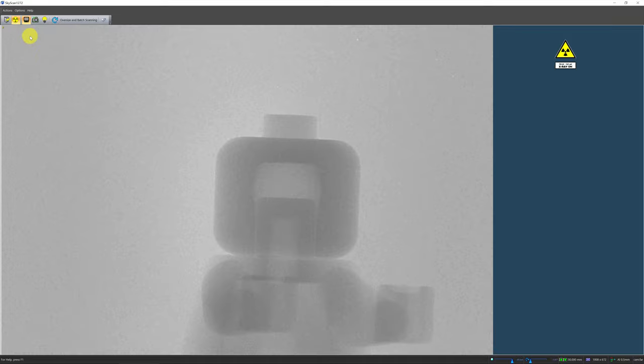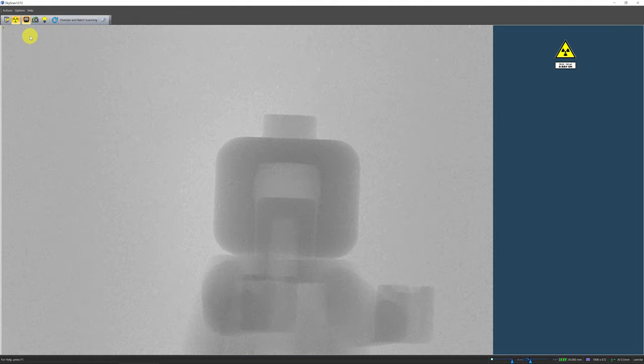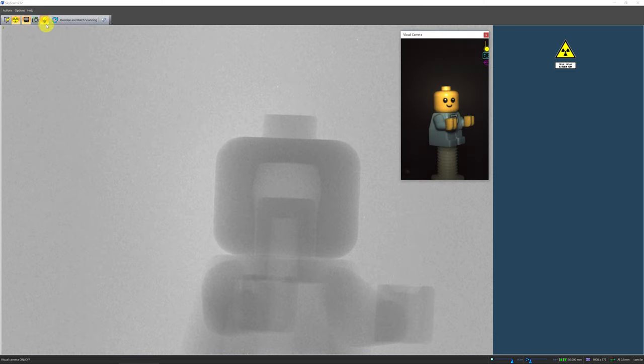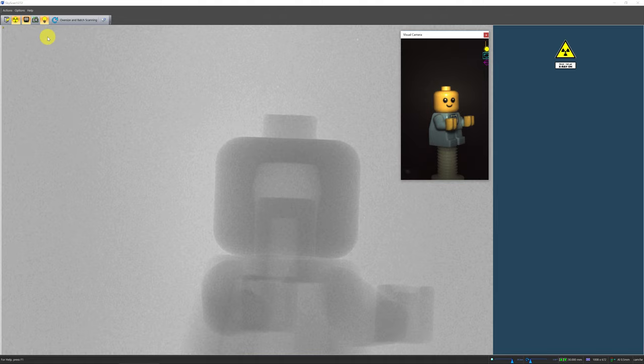First, switch on the x-ray source by a left mouse click on the x-ray icon. After seeing the x-ray sign appear on the screen, click the grab x-ray image continuously icon on the toolbar. The x-ray detector will now start capturing the x-ray transmission signal continuously and display the shadow projection image on the screen. You can also switch on the visual camera by clicking the visual camera icon on the toolbar. This will help you locate your sample if your sample has low x-ray transmission.